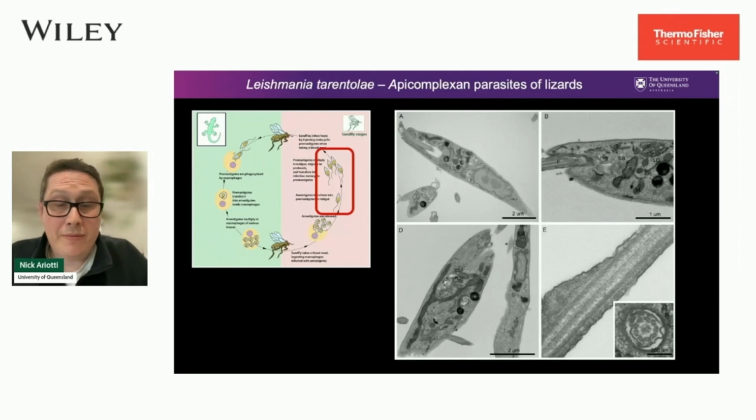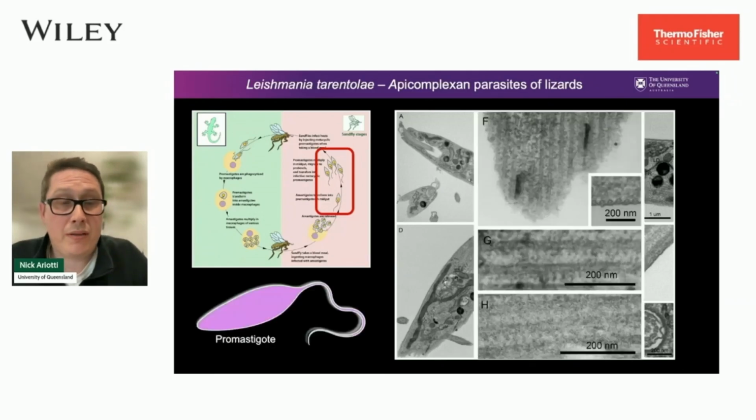They're simple but very interesting cells. They have abundant endoplasmic reticulum, Golgi, mitochondria, and strikingly abundant lipid droplets with a large flagellum. But I think the most distinctive feature is the subpellicular microtubules that are arranged all over the surface of these cells just below the plasma membrane. And you can see this arrangement here. What's incredible is that we can see a regular protein arrangement decorating these microtubules, even in conventional fixed transmission electron microscopy approaches.